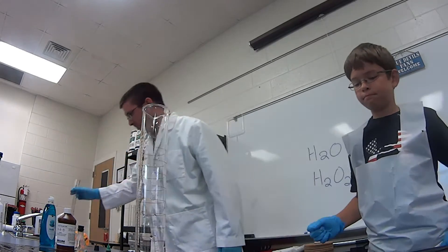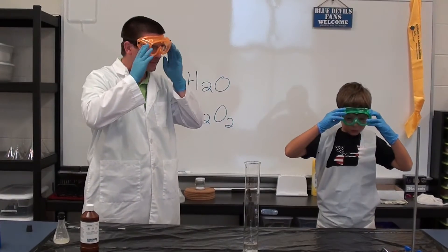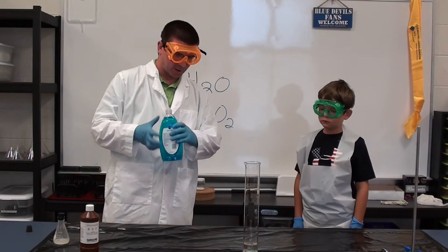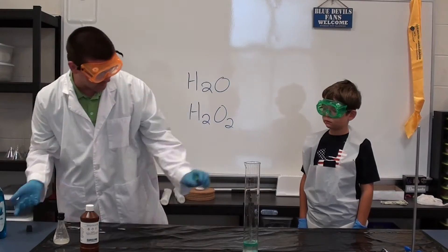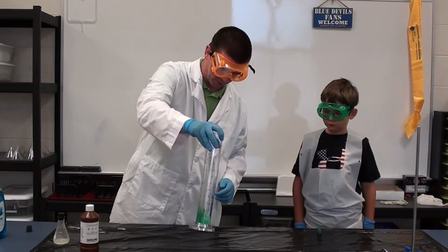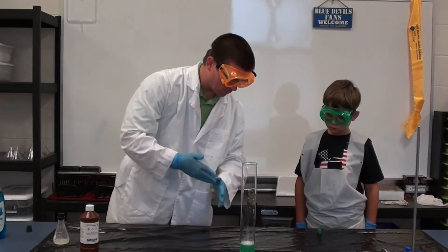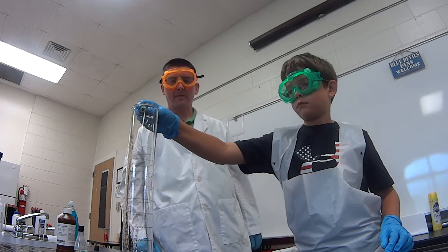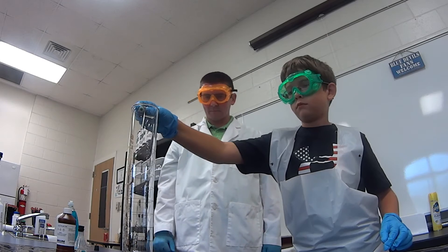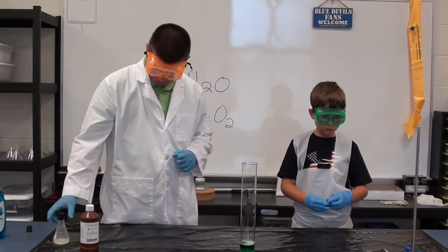And that's why we're wearing our gloves, because this can burn your hands a little bit if you get it on them. We're going to put our safety goggles on because this reaction is going to foam up a bit. Don't want to get anything in our eyes. We're going to add a little squirt of dish detergent. I'm just going to swirl this around, and then I'm going to have you put about five to eight drops of food coloring in there once it's mixed up good.